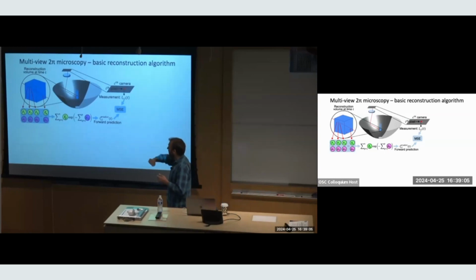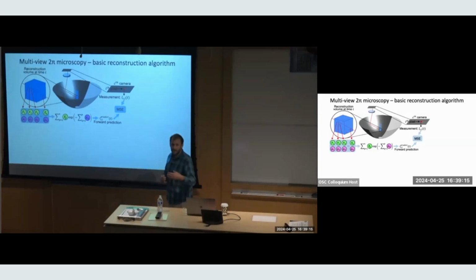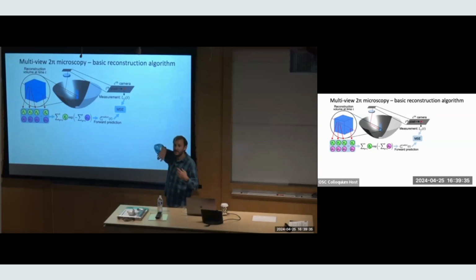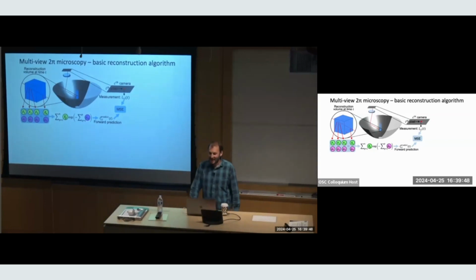We assign those, and then we have essentially a ray-based description of that radiation passing through the volume, where the sources accumulate along a ray, and then absorption attenuates exponentially, due to Beer's law type absorption. And that will generate some intensity on our camera. We compare that intensity on our modeled camera to the one we measured, and we minimize the mean squared error between our measurements and our prediction with respect to these values, right? And then we cross our fingers. No, it works, trust me. But you'll see.